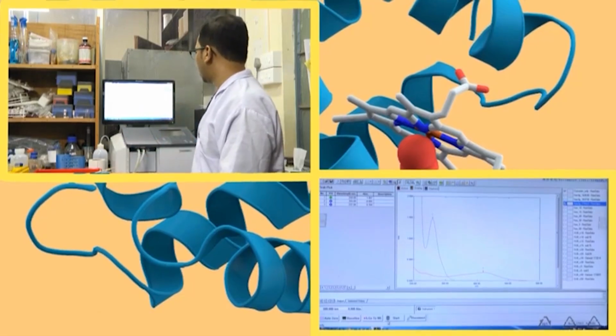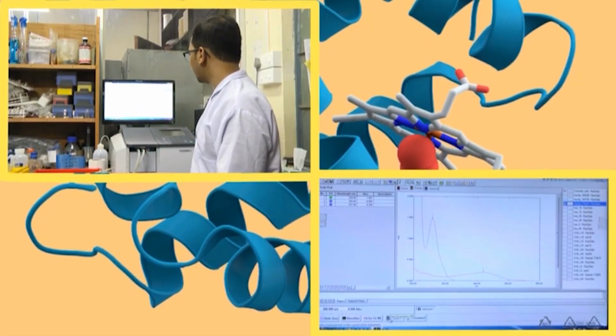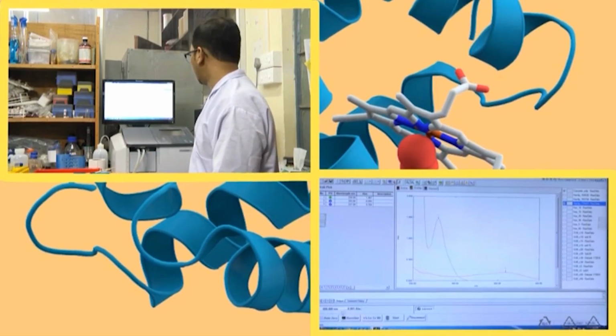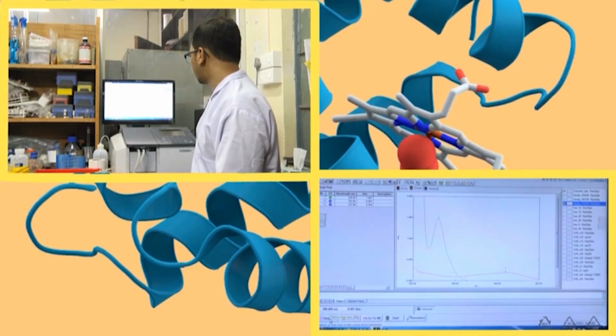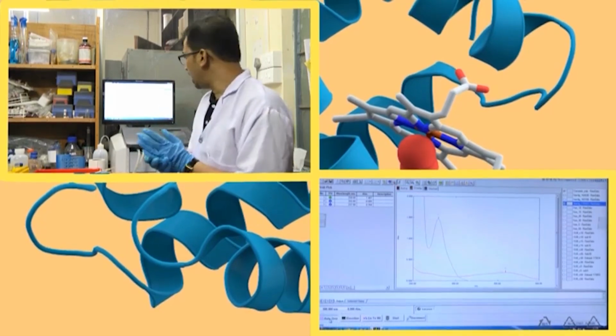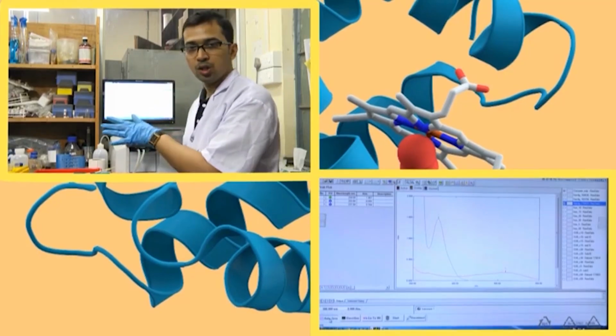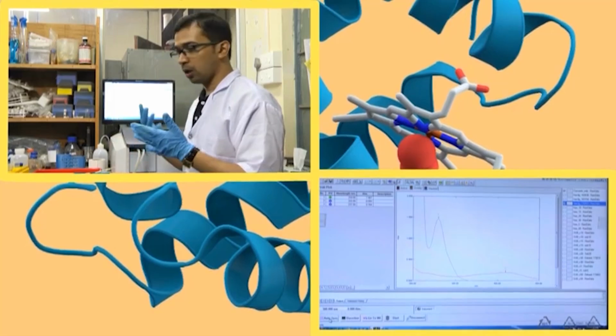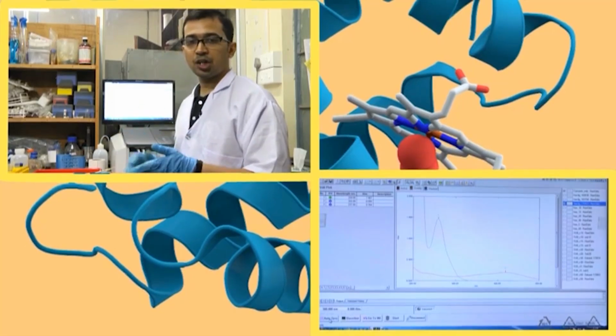So, we are again doing the start. We have to do auto 0. For that, let us do auto 0. And one thing is that if you change this wavelength range, some softwares might ask again for baseline correction within that range.